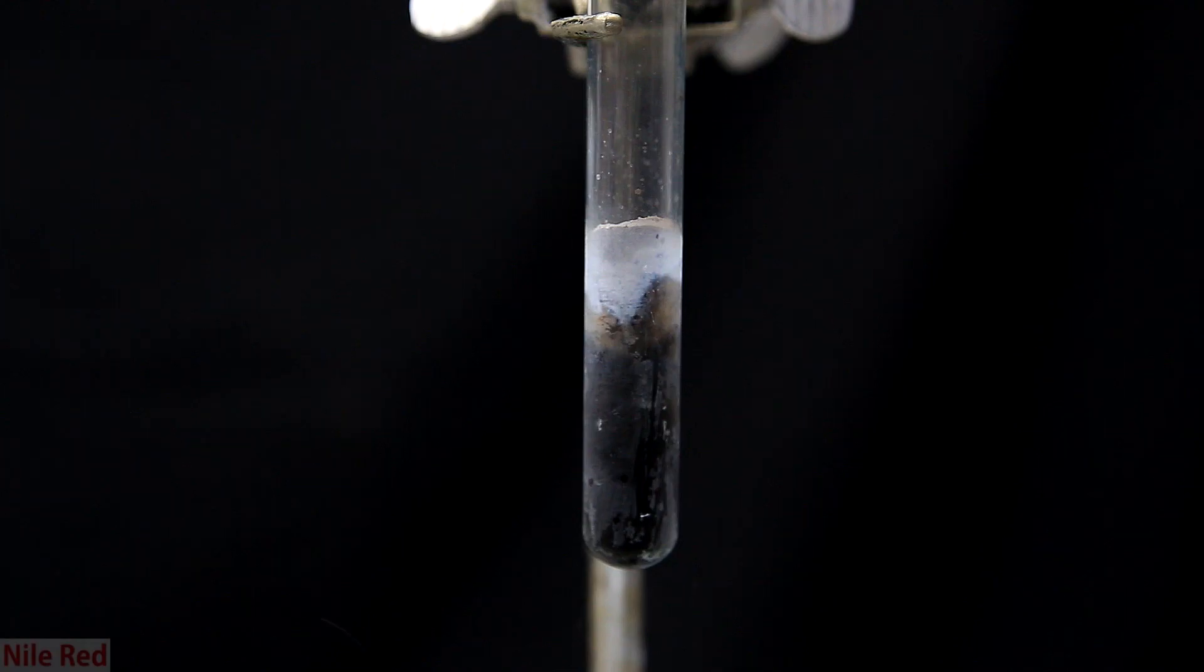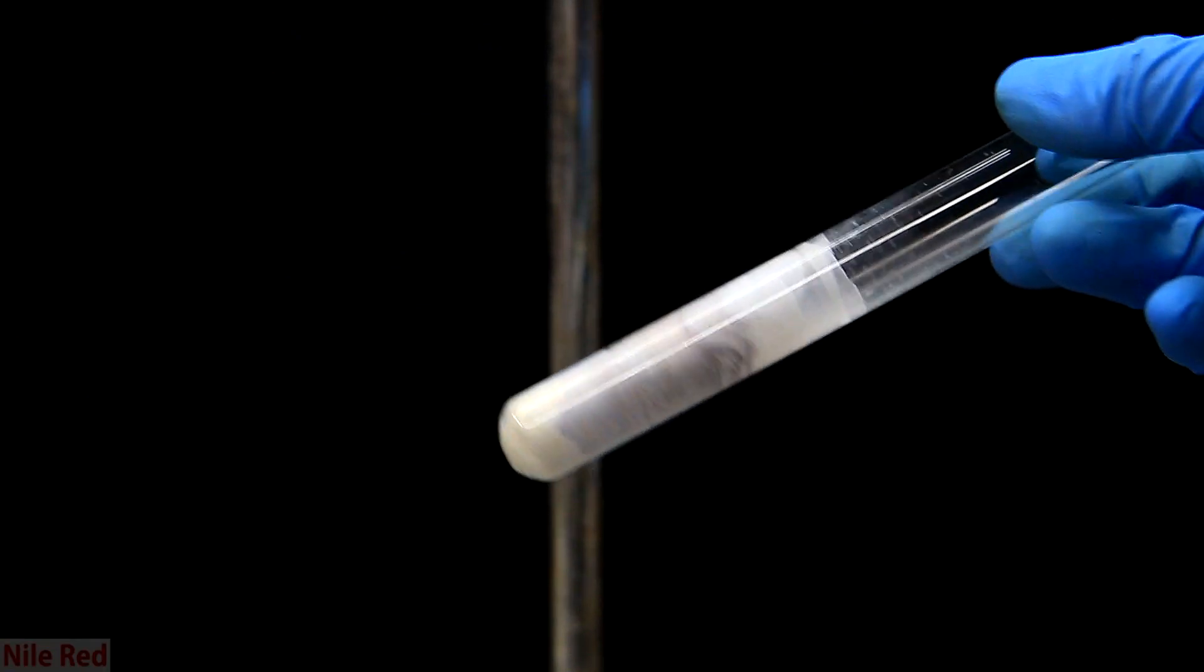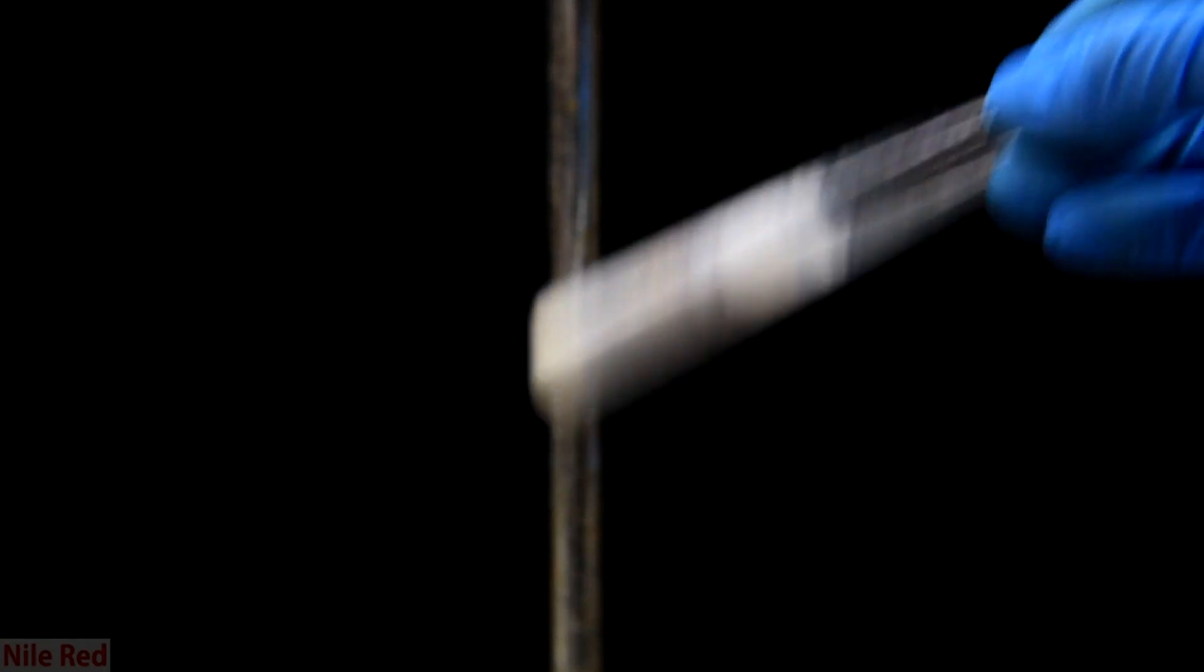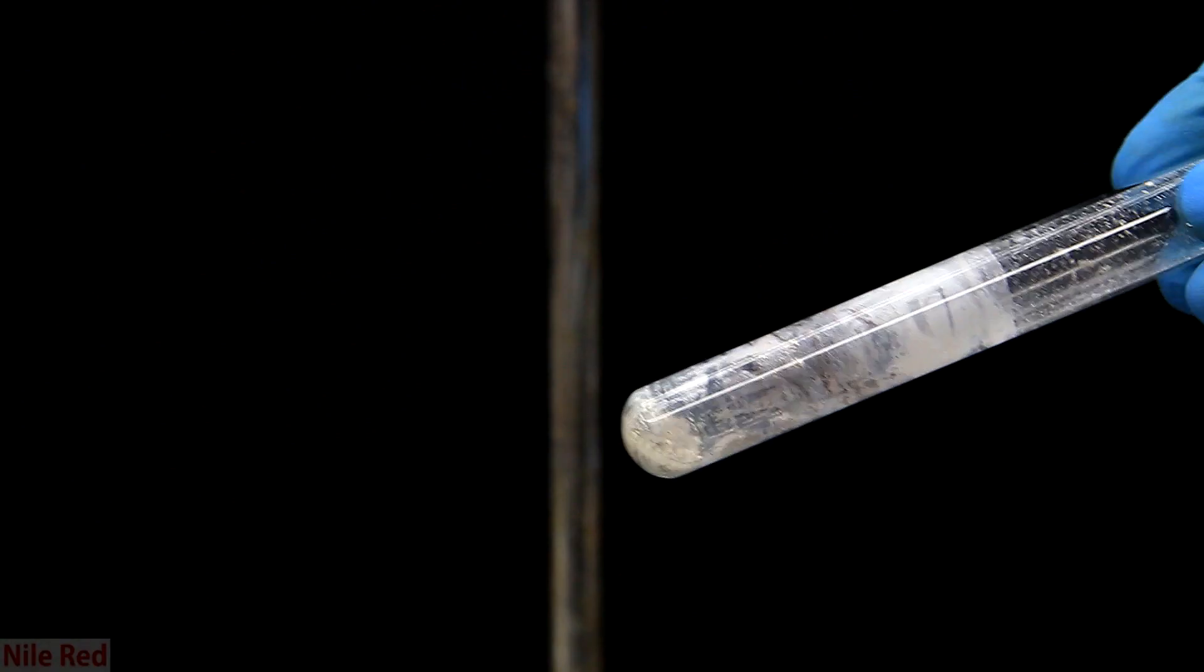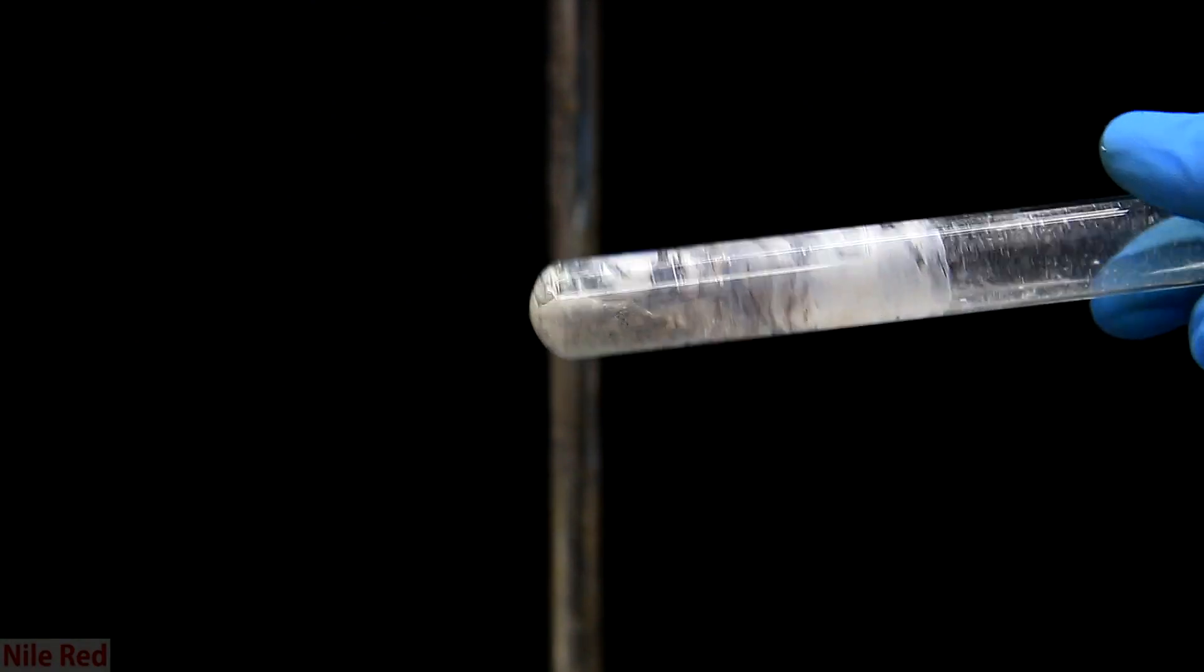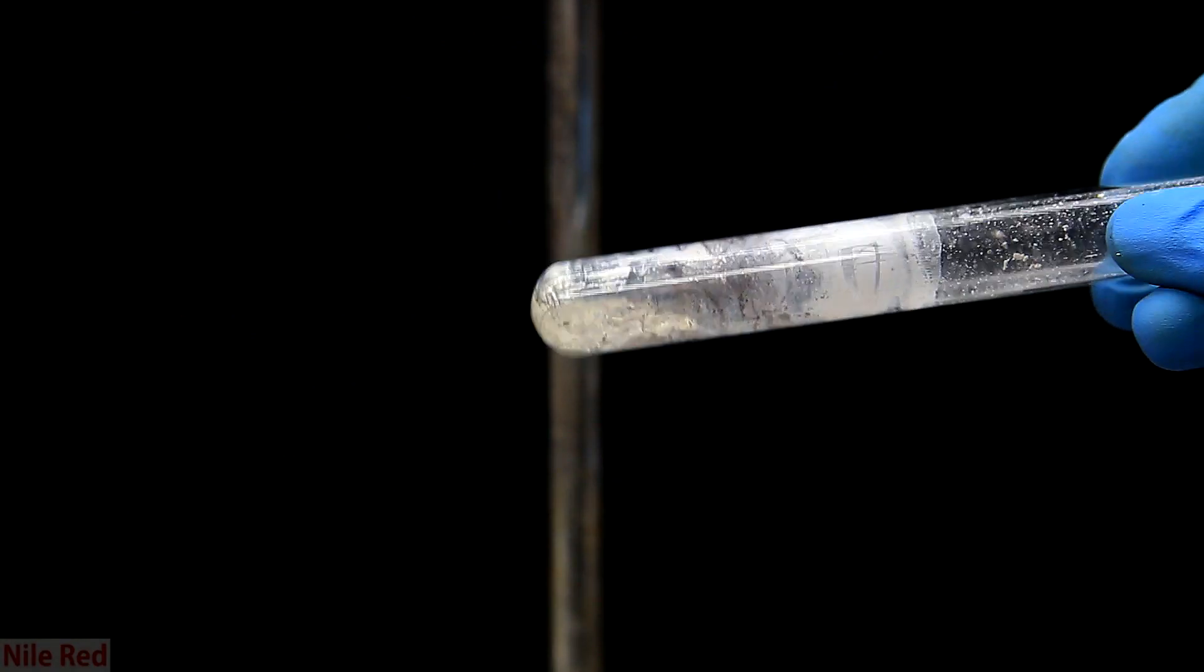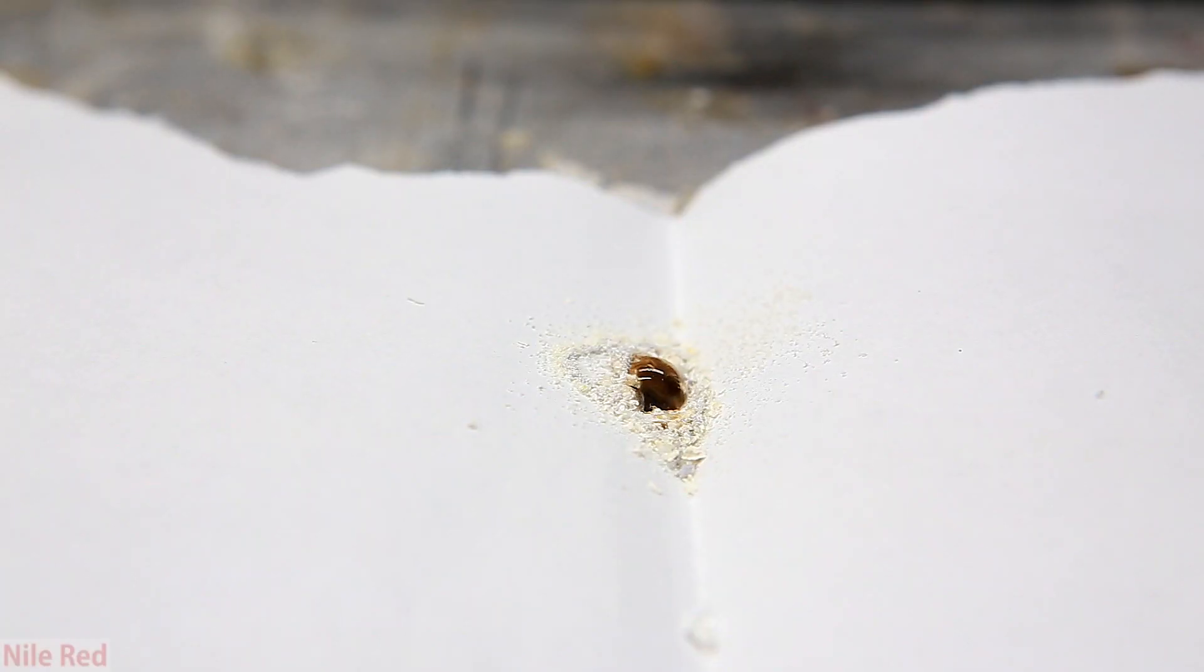After letting it sit for a little bit, it might start to splash because of the heat generated by dissolving the sodium. After a little while, we're left with a bunch of off-white powder in the test tube. I scraped everything off the side, and we're left with some off-white loose powder. When it's placed on a piece of paper, it starts to bubble and heat up. This is likely due to both sodium amide and a little bit of sodium metal reacting with the air.